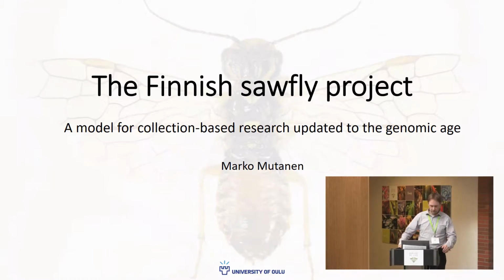My aim in this project is to give a new model, especially for entomologists, on how to do things better. And of course, the main idea is to demonstrate how to add the barcoding step to the normal taxonomic workflow and specimen handling.